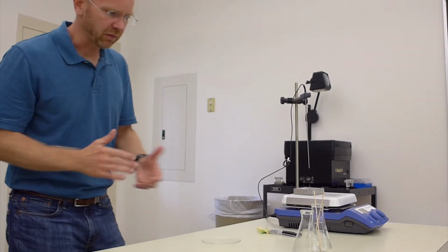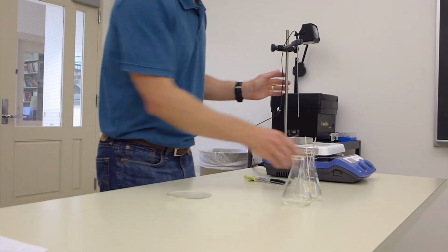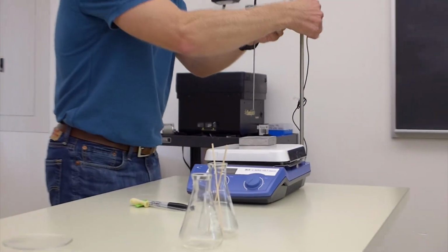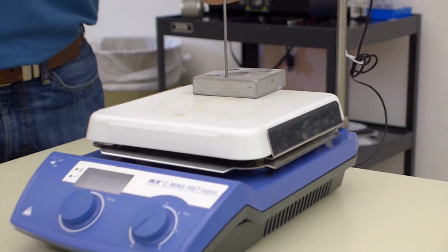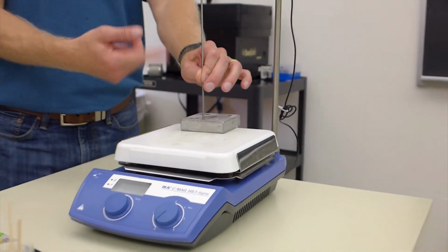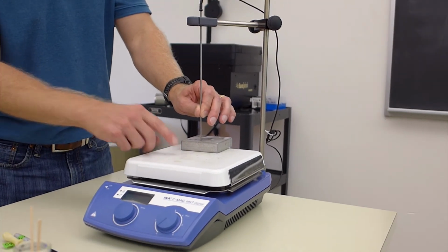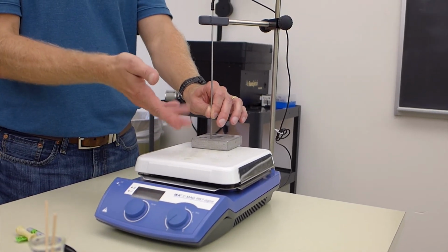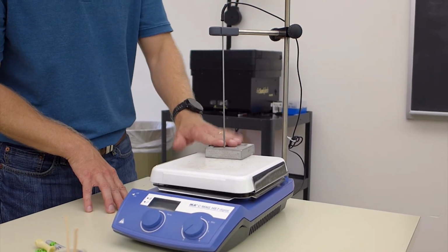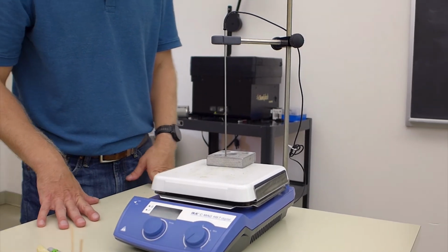So then let's imagine that you have the perfect solvent picked out. Let's just talk a little bit about the nitty-gritty of the actual protocol. Using the equipment that we have in the lab, you would want to set up your stir plate in this way. The first thing is, if your hot plate is setting its temperature based on the thermocouple, the thermocouple must be somehow in contact with the surface of the hot plate. We usually use these aluminum blocks to make that connection. If this thermocouple isn't touching the hot plate and you have it set to some temperature, it will just get hotter and hotter and hotter because it can't sense that it's warming up, right? So you've got to make sure that the thermocouple is in contact with the hot plate. For recrystallization, you can just stick it into the aluminum block.